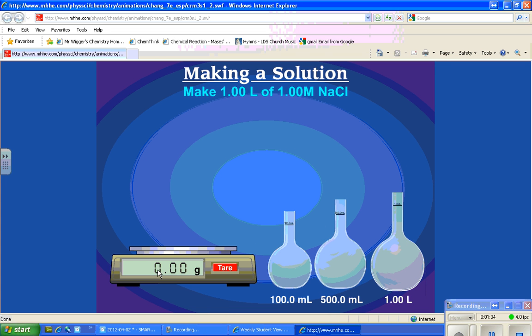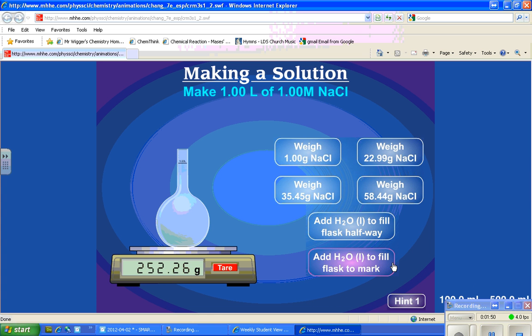To begin, click on the flask you will use to make the solution. This solution has to be one liter of solution, so the volumetric flask you would want to use would be the one liter flask. Click the tare button to zero the balance. The tare button removes the weight that is part of the flask itself. Unfortunately, we don't have scales like that, but we're going to pretend that we do in this animation.